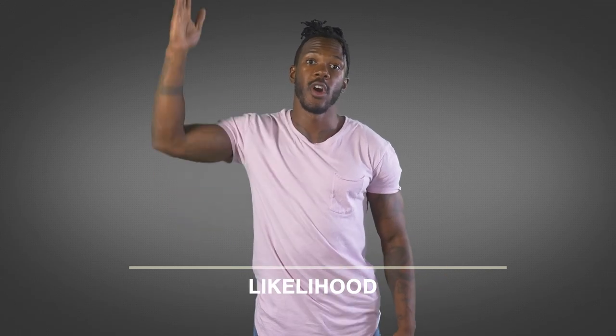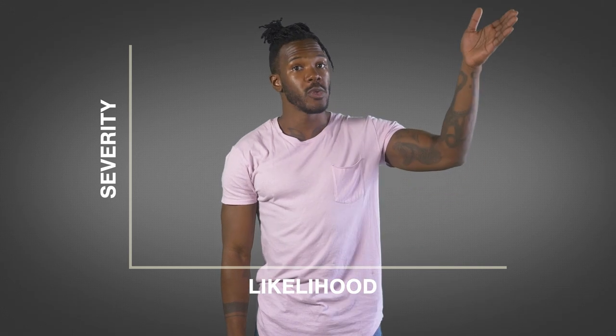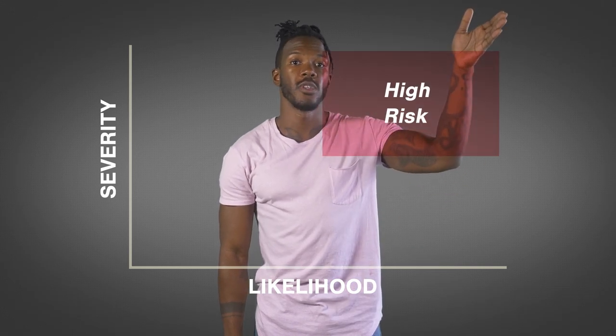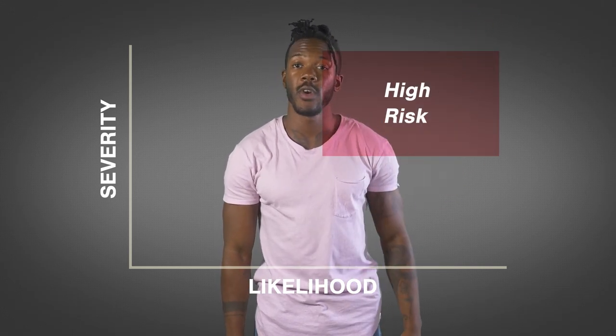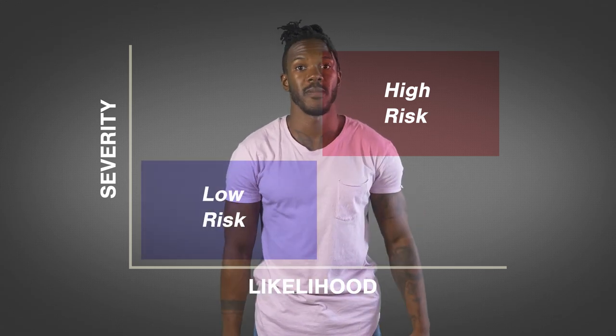For each potential hazard you've identified, it's important to analyze the degree of risk, the level of danger. Fortunately, there's an easy way to visualize risk, known as the four-quadrant approach. On the x-axis, we can map the likelihood of exposure to the hazard, and on the y-axis, severity of the danger. The highest risk activities are those in the upper right quadrant. They have severe consequences and are very likely to happen. The lower left quadrant represents the lowest risk.